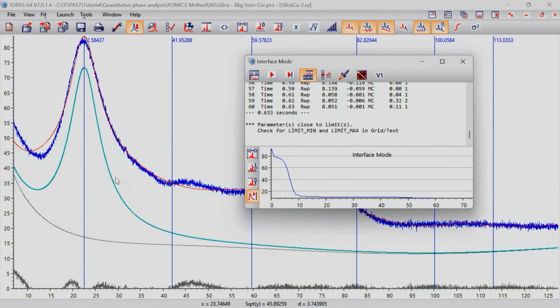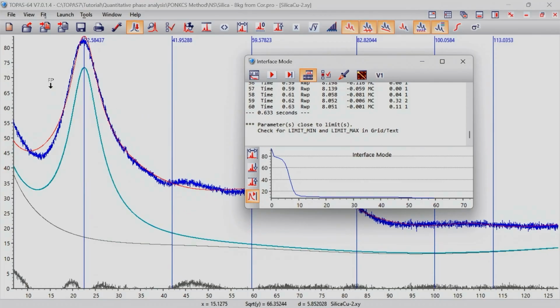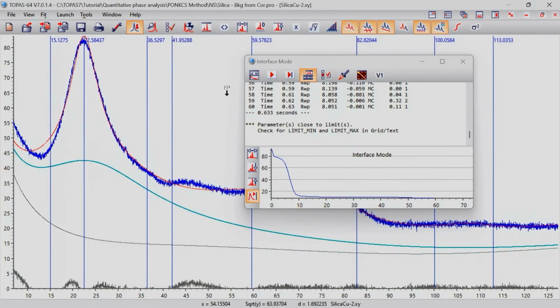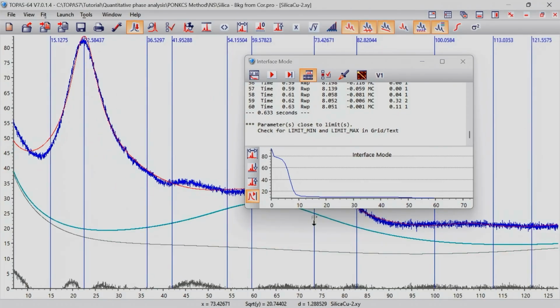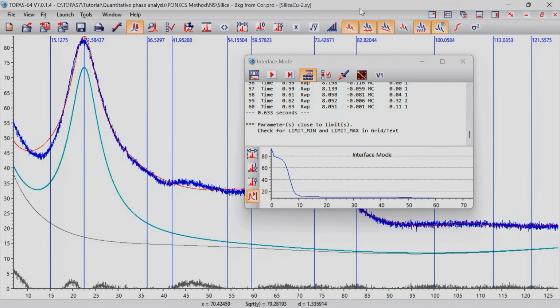And if I feel that my peaks are not giving me the perfect distribution, I mean, here's some misfit here, you can see it in the difference plot, I can add some more. The important point is it does not matter if the peaks have any physical sense. What you want to have is a perfect description of the intensity envelope, because at the end of the day, you are dealing with the envelope and you are scaling the intensity envelope to your observed pattern in the data.